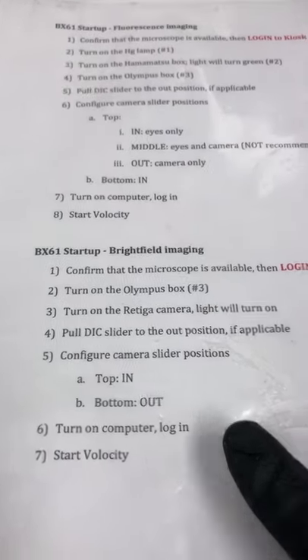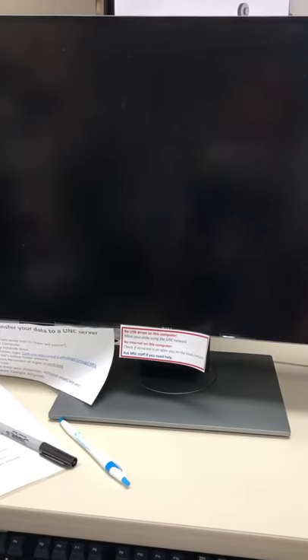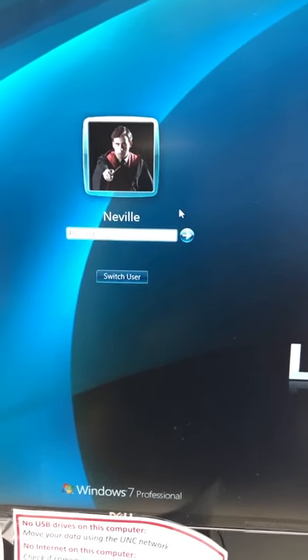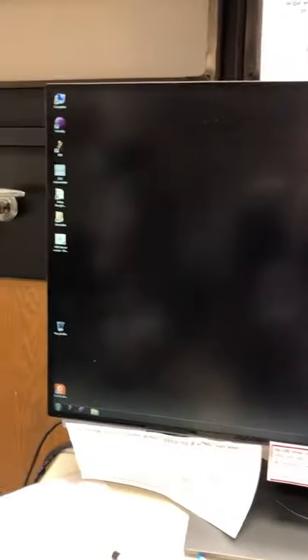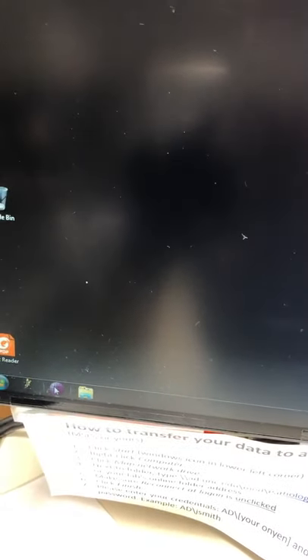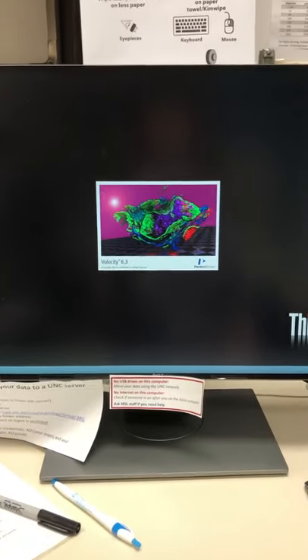Now turn on the computer and log in, then start Velocity. Once the computer finishes starting up, click on Neville — that's the nickname for this computer — and input the password, which is MSL. Then start Velocity, the software that controls the microscope. Just double-click on it once; if you don't wait and double-click again, you'll get an error message, so be patient.